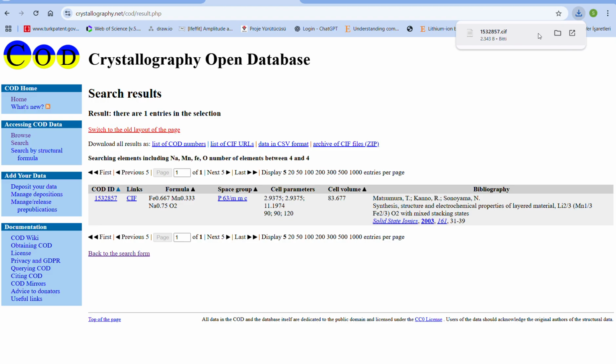Okay, but according to your experience, which one is a good method? Both of them are the same. If you have the zip file, you don't need anything. If you have the Match program and the phase is unknown, you can go there. But if you know this is P2 type, just download this one and work here.